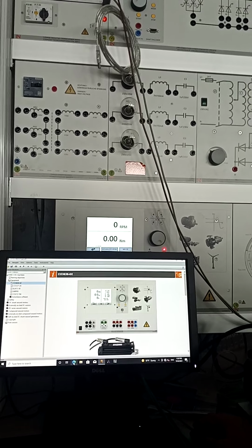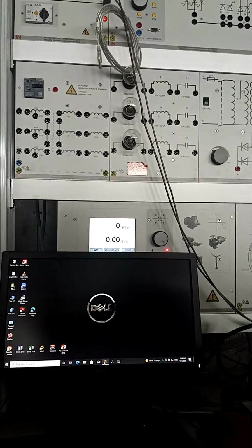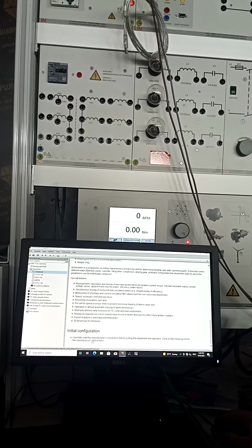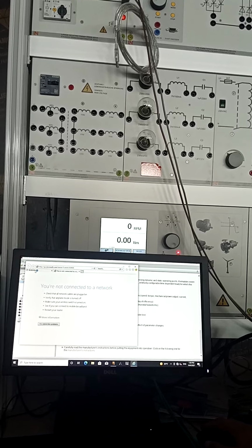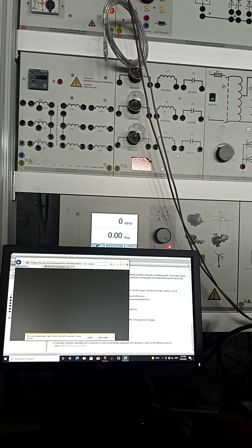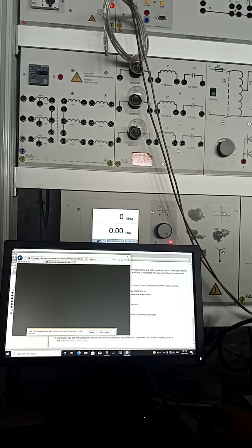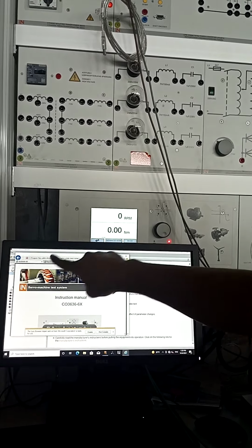Normally, this one can do that. Material, this one. We need only to accept something because that's first use for this program.